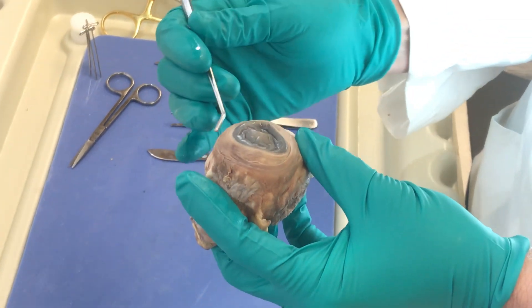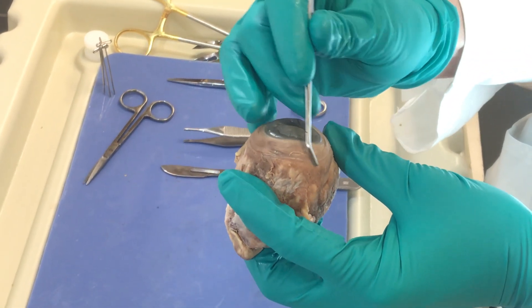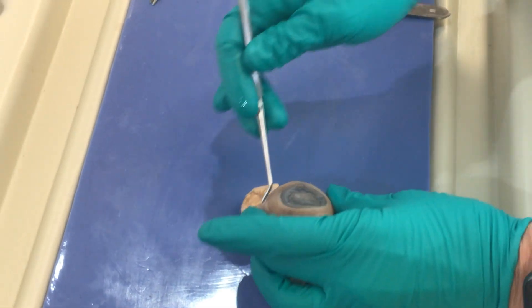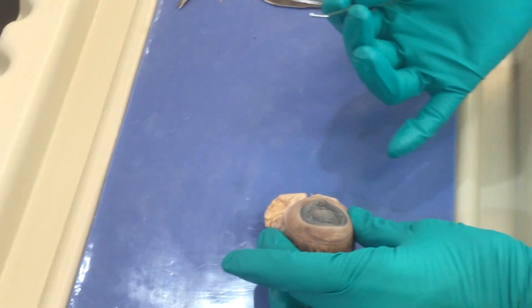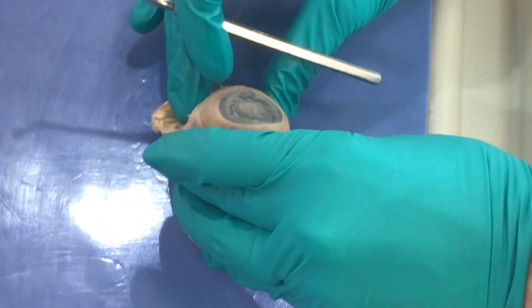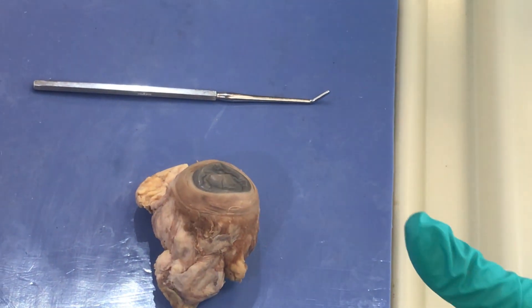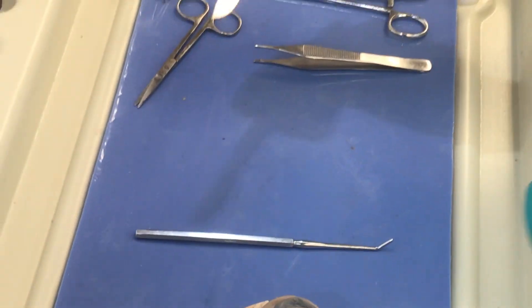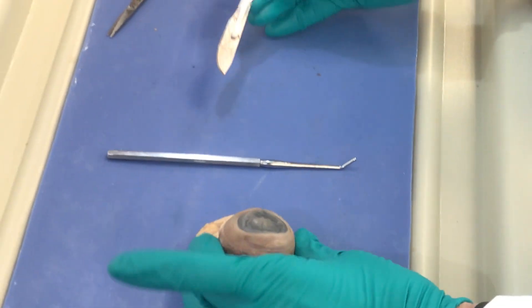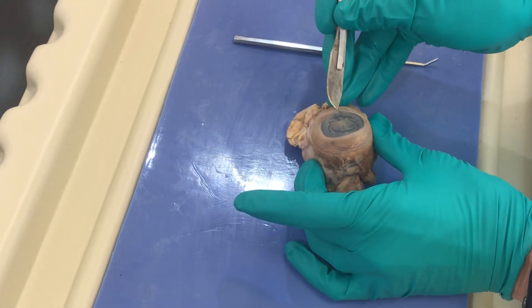Here again we have our eyeball. The white part, which is hard to see because it's covered by conjunctiva, is called the sclera. When you make your incision, your book might tell you to clear away all of the extraocular tissue. I don't tend to do that because it allows the eyeball to sit in a firm way and not roll around, giving stability when making incisions. It's very important that you pay attention to your blade orientation — you do not want to cut towards yourself.